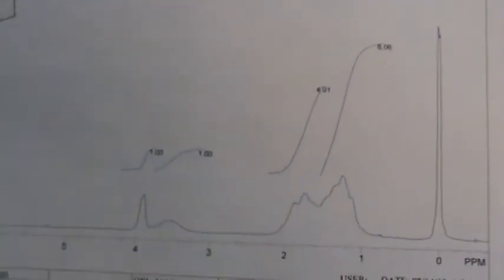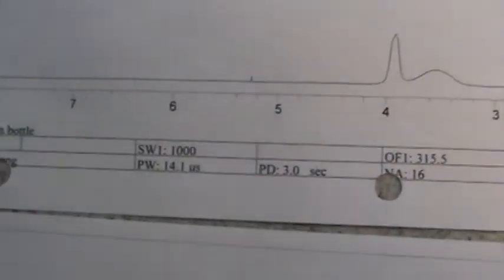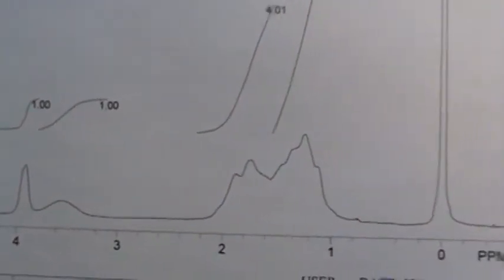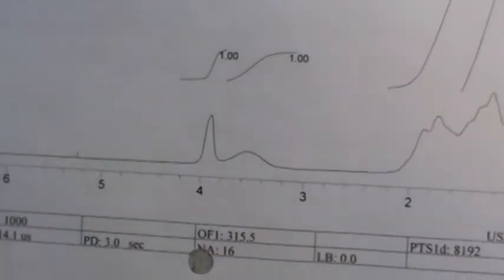So now we start with cyclohexanol, and then we oxidized it with a Jones oxidation to get cyclohexanone. So I'm looking at the NMRs at the moment. We can start here, why not? Clearly this was run on our instrument, and I took cyclohexanol straight out of the bottle. And on that day that I ran this, I'm pretty darn sure that the sample wasn't spinning great. So you can see how broad those peaks and absorptions are.